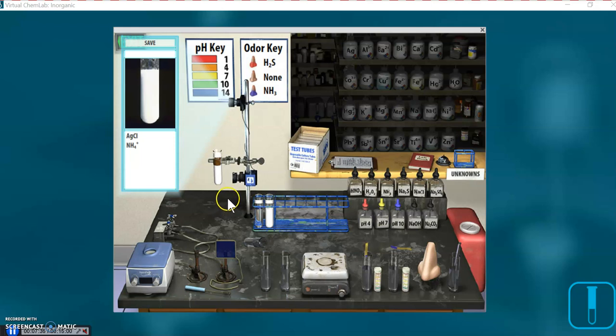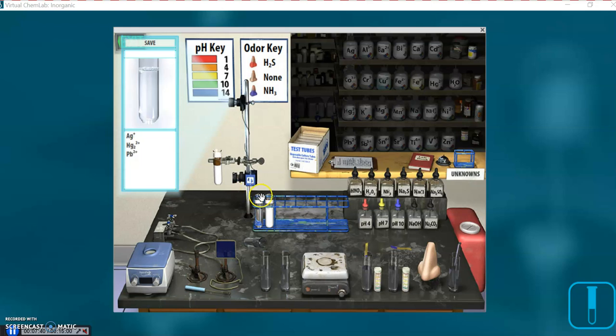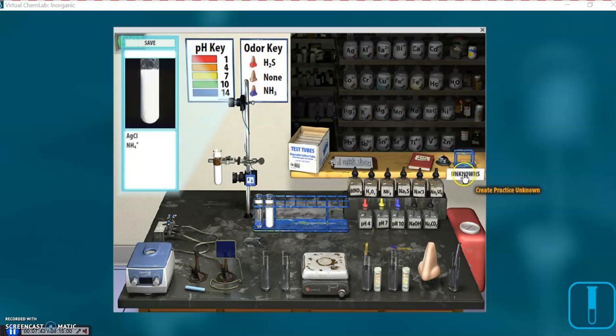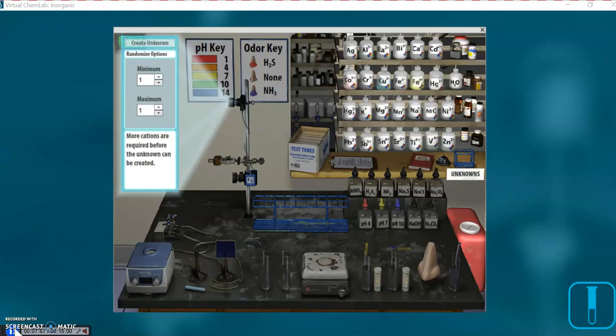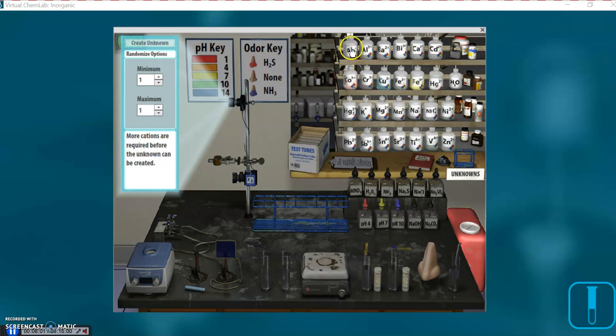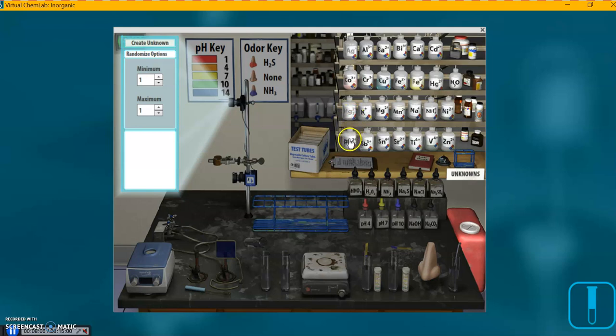That's step 7 on your worksheet, by the way. And I believe the worksheet says to click on the unknown. What I'm going to do, it doesn't mention it on the worksheet, but I'm going to clear the lab out. And that should make the unknown ready to go. I'm going to click on it. To make the practice unknown, we're going to click our ions again. Silver, mercury 1, lead. Now notice this is an unknown, so it's not over here showing what's in our solution.